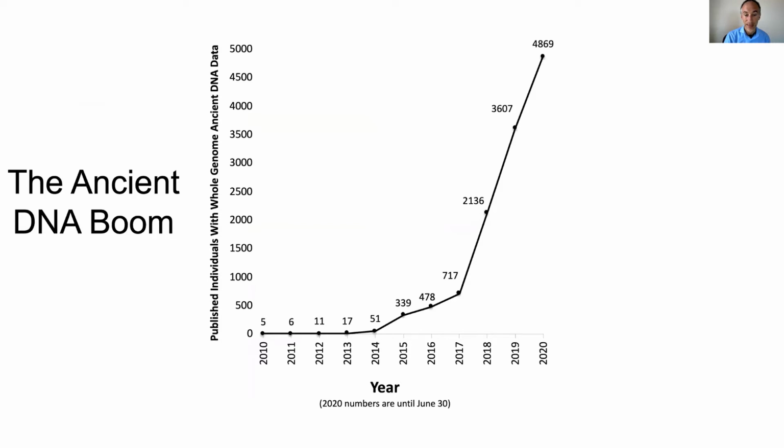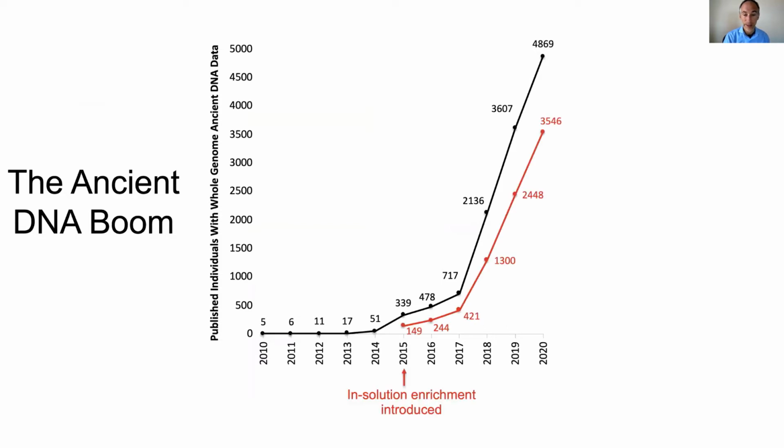Since 2014, there has been approximately a 100-fold increase in the amount of data, and it continues to grow rapidly. A key innovation that made this rapid growth supercharged was the deployment of in-solution enrichment beginning in 2015, which was something that our group, Nadine Roland and I, really had a central role in, where we really thought that this would be a way to greatly increase the amount of and number of samples that we could screen.